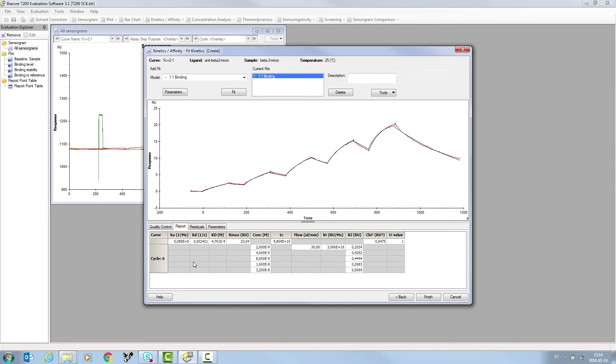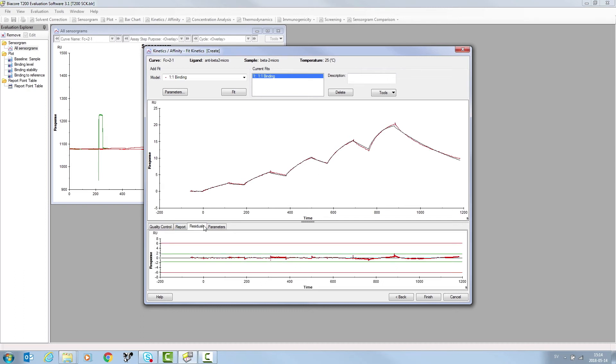Click on the Residuals tab to see a representation of the fit of the mathematical model to the experimental data. In this example, the residuals are within the two green bars, regarded as an excellent fit.